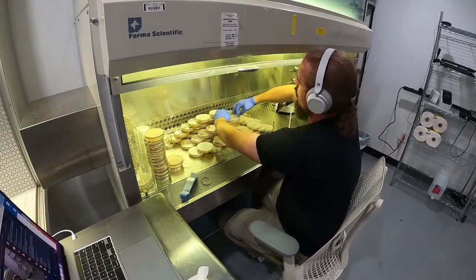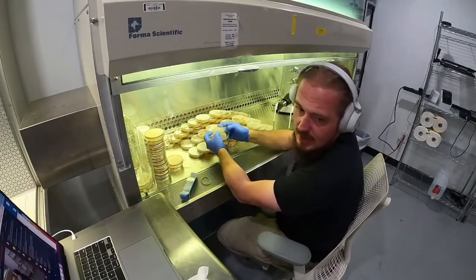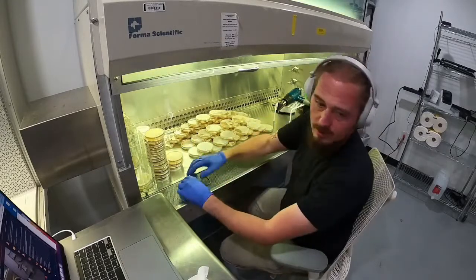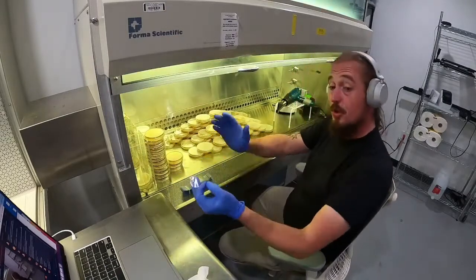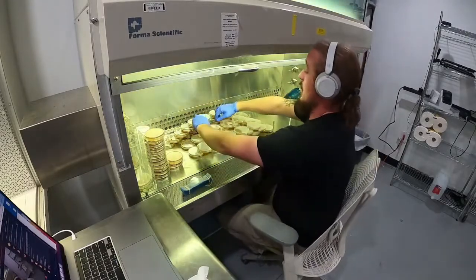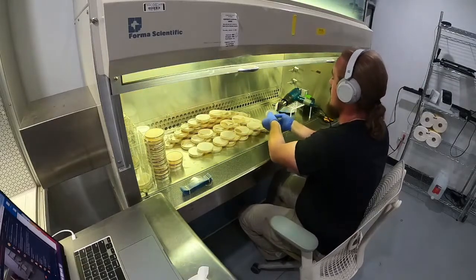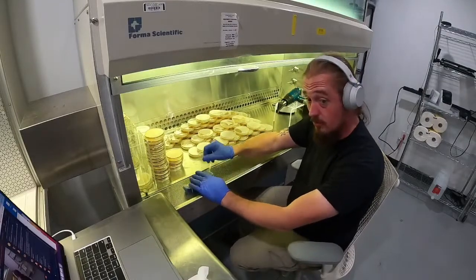And so with spores, you really have to think of those as eggs, right? They've got to be incubated. They have to be taken care of. They're not strong enough to fight off trichoderma, blue-green mold, even the smallest of bacterial infections could throw off a mated pair of spores if it's early enough in their development cycle. So usually the process is you take spores, like a spore print, a spore swab, or a spore syringe, and you apply that to agar. That allows the fungus to actually germinate, and then you can take that and apply that to grain, or make a liquid culture from that.